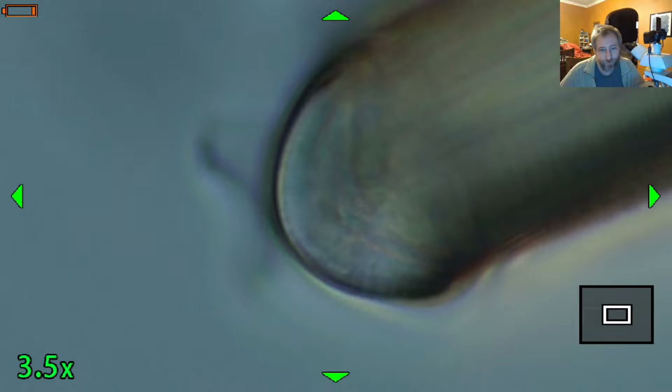Because you have to clean up the condenser, and it makes a mess, and it could be really messy, especially with my students. I don't ever try to have them do it because they have a hard enough time just putting a little drop of oil on there and not making a big pool of an oil spill on my microscopes. So definitely don't want them putting it on the condenser. I'd have oil all the way down inside of everything.